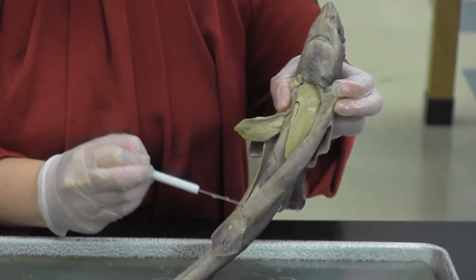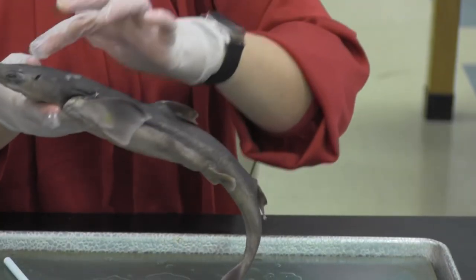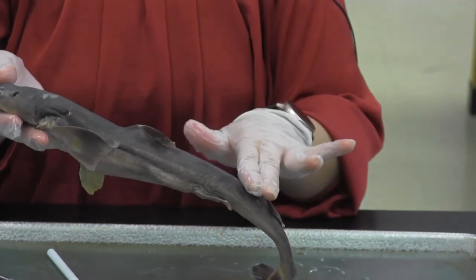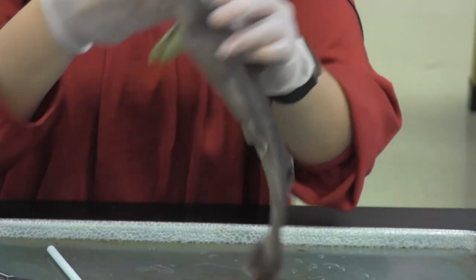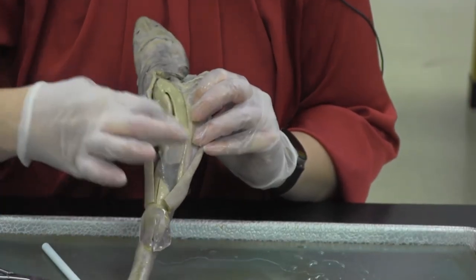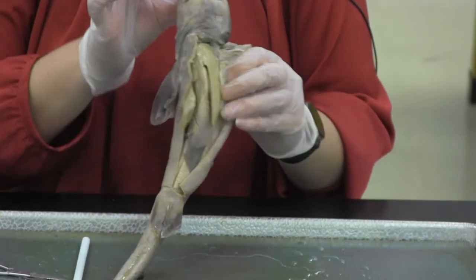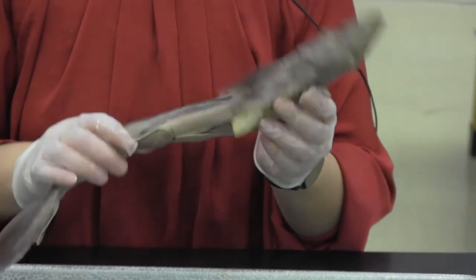Coming down here, this is solely her digestive tract. They do have a brain up at the top, used to control their senses. Another lesser-known fact is that sharks have a skeleton made of cartilage. The main features I want my students to identify are the digestive tract and the liver. If time allows, I let them cut in to see the brain, and if they want to explore a little more — and that is your dogfish.